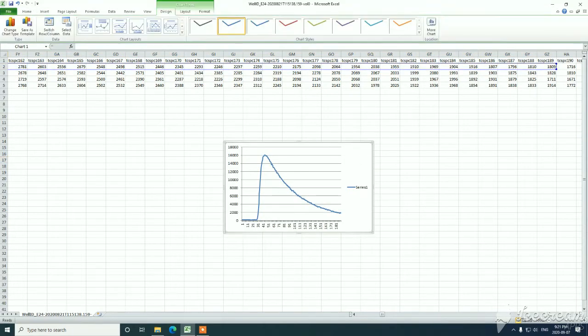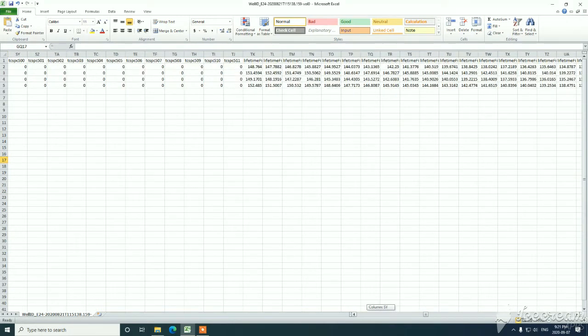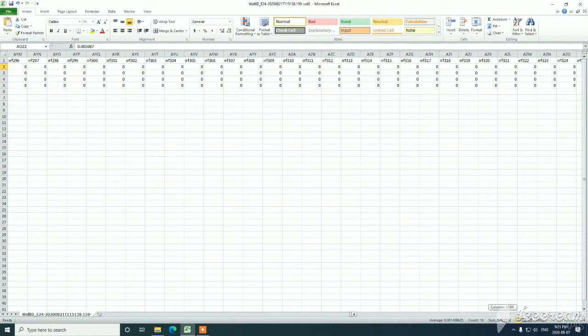Again, if we go down further, we'll see the estimated lifetime profile from the fitting. This is convolved with the instrument response function, or the IRF. The IRF profile is also plotted here. A lot of this data you'll see is redundant, so there is a more efficient way to do this, and you can generate your own data. You can write your own scripts to generate similar information.